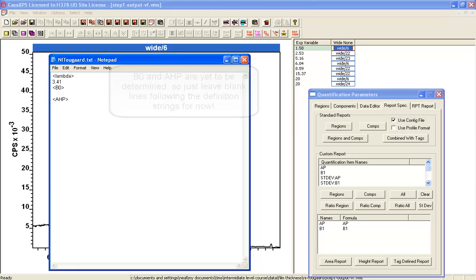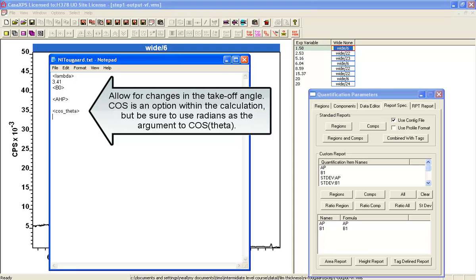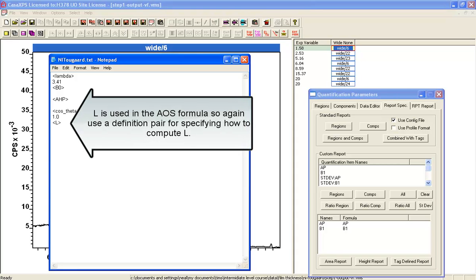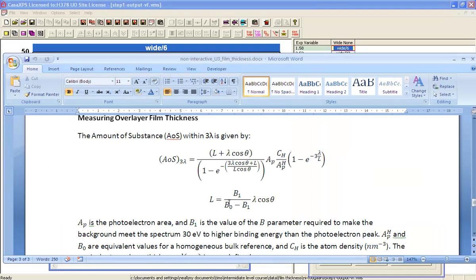And then we also need to say cosine theta. As I said before, since it's going to be one, cosine of zero is one, we'll enter that. And then we'll do the first definition of L. So L is equal to, now let's have a look at the equation, it's B1 times lambda cosine theta and that's divided by B0 minus B1.